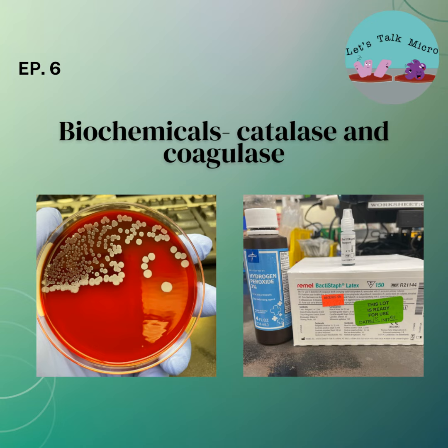So if you start thinking about that morphology, take those pictures, you're looking at them at home. At the very least, if you have that questionable reaction, you look at the organism and are like, wait, I think this looks like an Enterococcus. So it should be negative. And that way, you don't end up calling it staph. In an academic scenario, I mean, you lose points, right? So you might not do well on the test. But in the lab scenario, you might end up making a mistake that might cause harm to your patient. And like I keep saying, this is all about the patients.